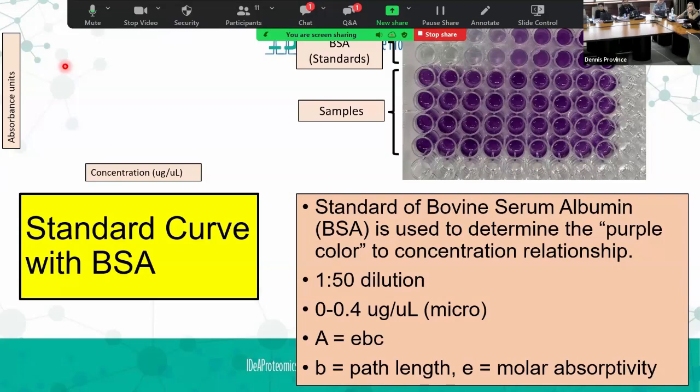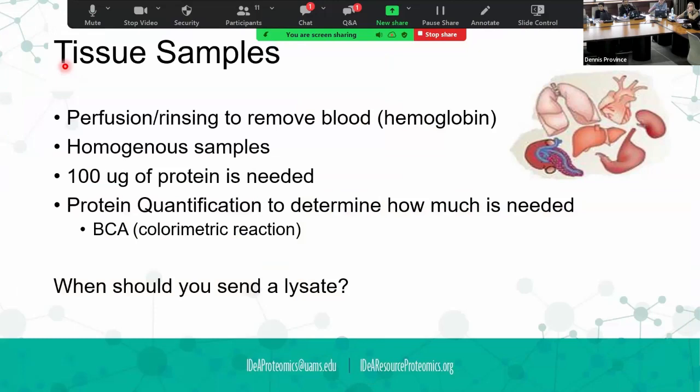Rick? So that's not something we're going to do. Right. There are kits for membrane preps that work reasonably well. The only thing I would say is that if you're going to do that, there's variability in that, and so you need to increase your replicates accordingly, because anytime you increase variability, you need to increase replicates. For extracellular matrix, that is almost a field of its own, and so I would say that expertise is going to have to come from the PI.